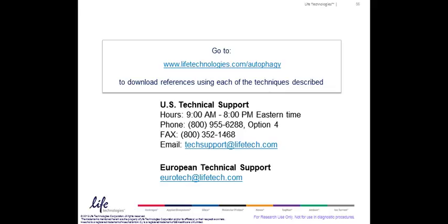Now, following the webinar, we'll attempt to answer some of the questions that may have been posed. I believe we just have the one question come up. The question asks, can these antibodies be used on ex vivo purified human samples? And is it sensitive enough for cells not undergoing starvation?